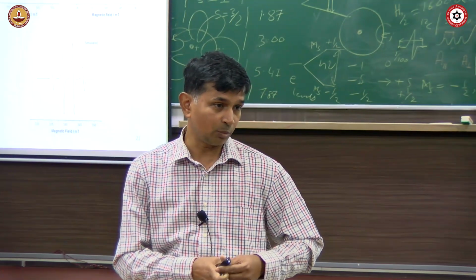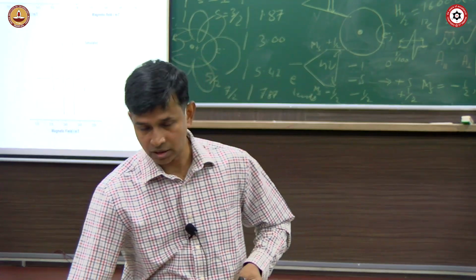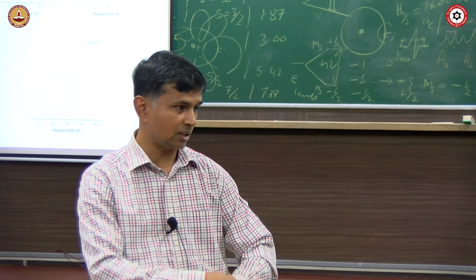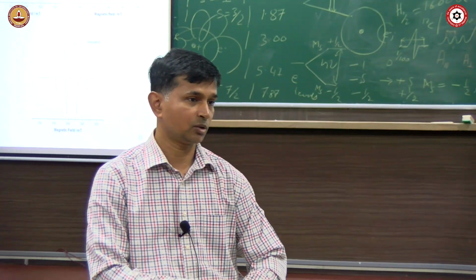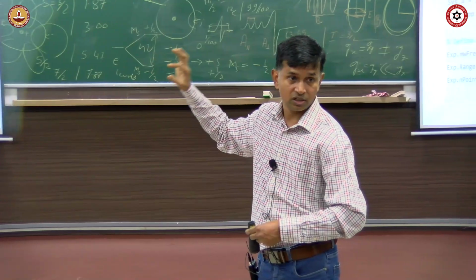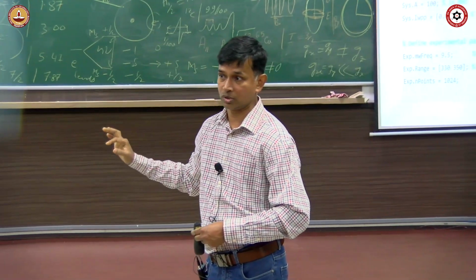So that means what? It senses like if an ant is touching me or a snake is touching me, the way they bite you, you feel a different pain, right? So you can sense it. EPR spectroscopy is so sensitive to symmetry, geometry, and spin distribution.